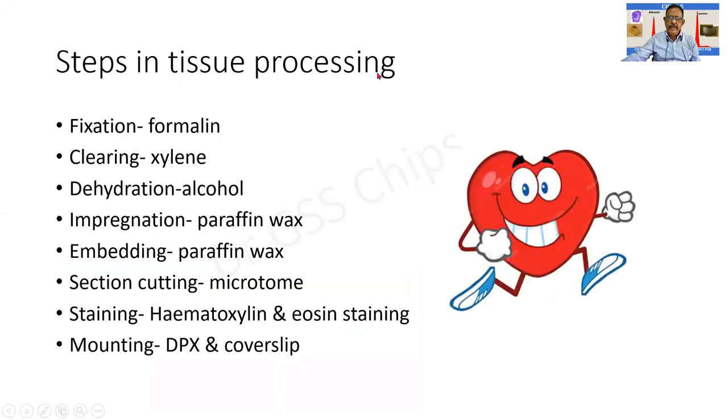Normally, during tissue processing after surgery, the following steps are to be met with. One is fixation, the other is clearing, dehydration, impregnation, and embedding. And the reagents are given by the side. Please memorize this particular list.